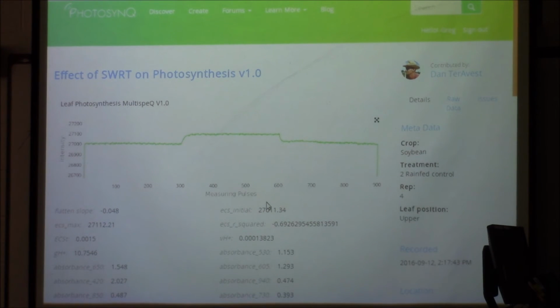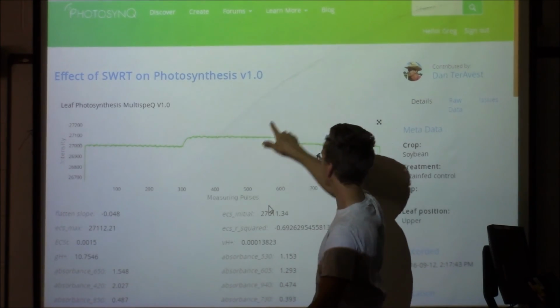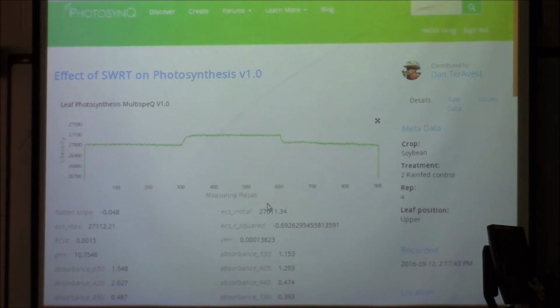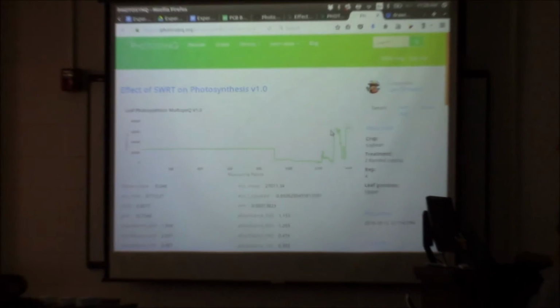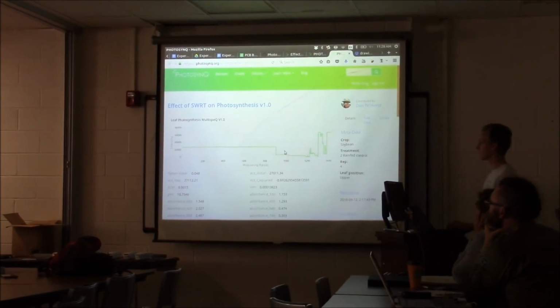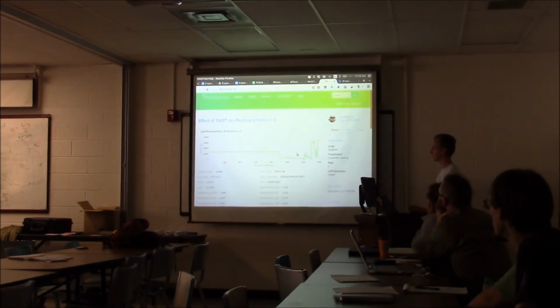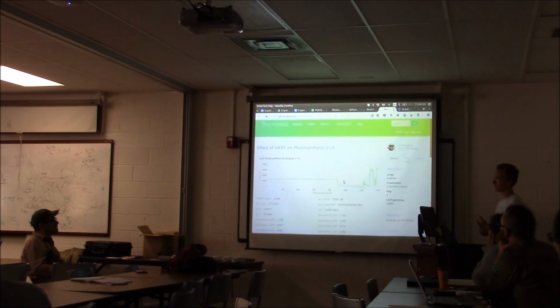The fluorescence measurement is a lot more robust, actually. If you move around, you don't see it. But with this one, it'll just go like this. We're working on it. We may have to add a reference wavelength or something. It's clear that this trace is probably too long because most of the stuff is happening very briefly. We'll optimize this more before we do it.